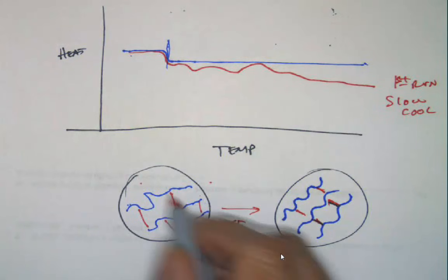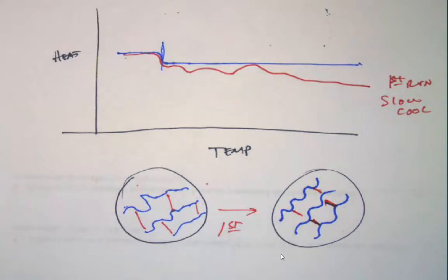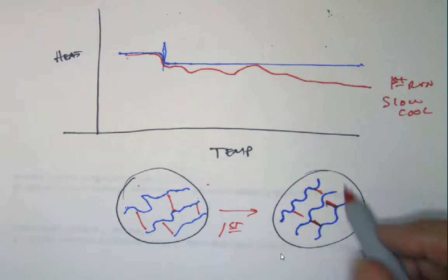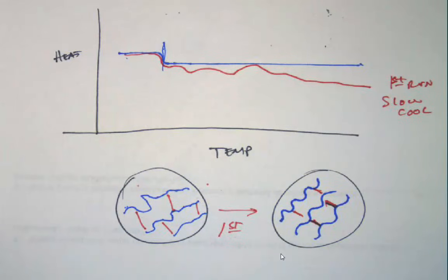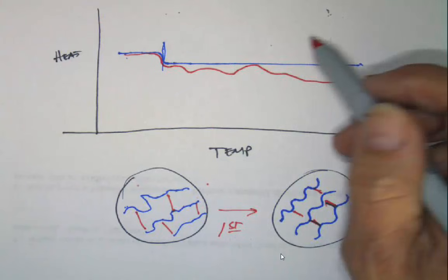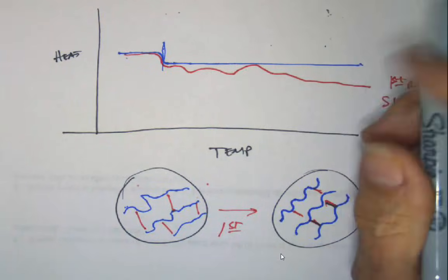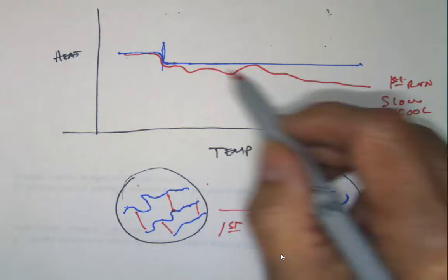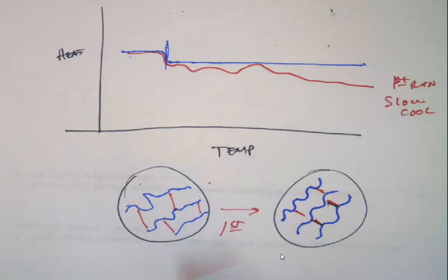And so what's happened is on your first run, you have converted from this kind of strained molecular orientation to a fully relaxed minimum energy arrangement. And that's what's going on in all of these bumps and peaks that you're seeing on the baseline. So a messy DSC sometimes is difficult to interpret, which is why we usually will run things twice, even if we don't think there's going to be any change in the key signals, in this case the Tg. A lot of times the noise that's generated by the stretched molecules and other things goes away and things get a lot clearer. So what should you be able to tell from a DSC?